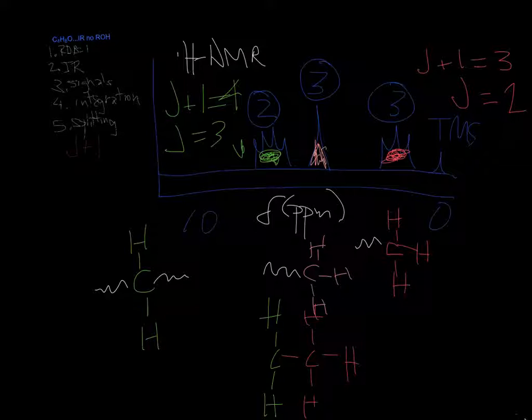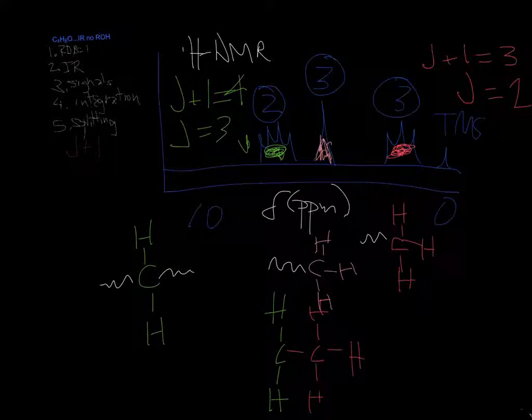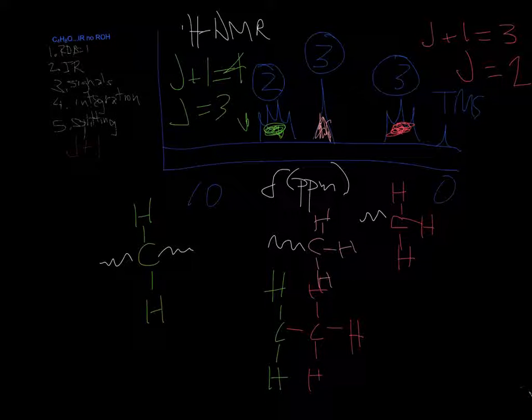That still leaves this one right here by itself. Let me see, can I move that up? Oh, it moves all of it, unfortunately. Okay, if we look at the one that we haven't done yet, it's a methyl group. How many hydrogens are on the carbon or carbons next door to it?